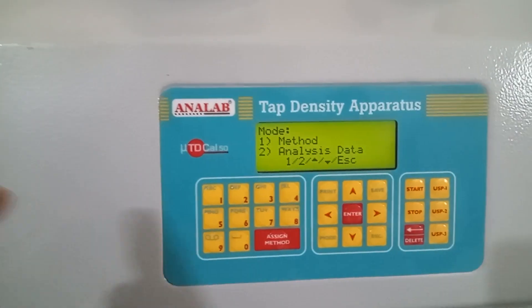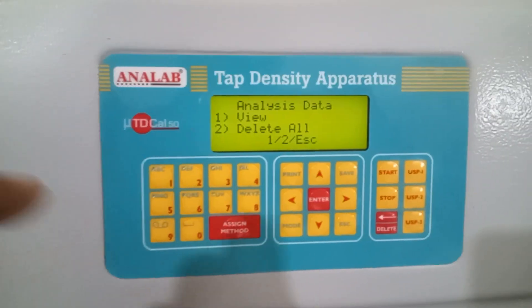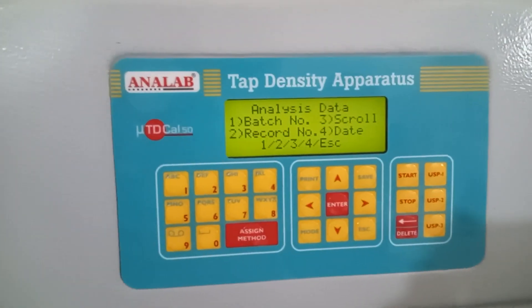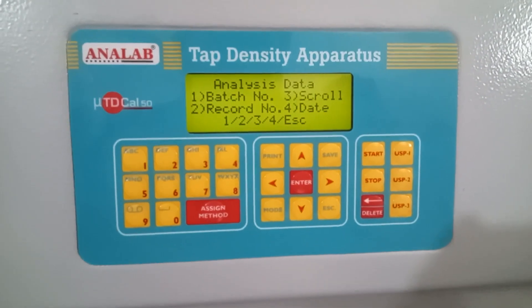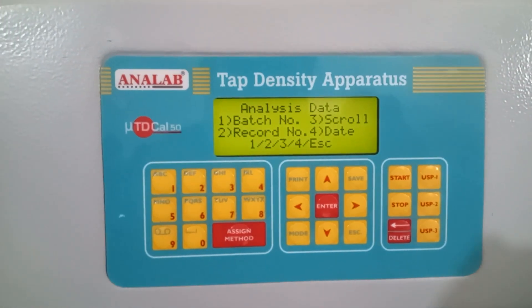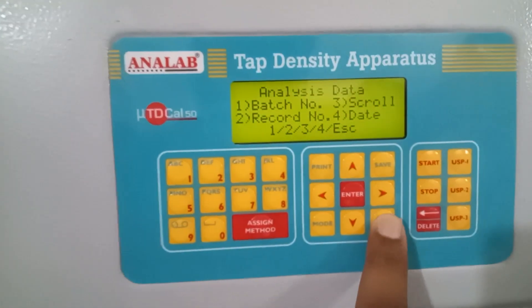The second one is analysis data. In this particular model, it has a facility to store 1000 analysis data records. We can view this analysis data from here. The analysis data can be viewed and sorted by batch number — either by scrolling, or you can directly select by record number, or you can scroll by date. These are the options available for viewing the analysis data.